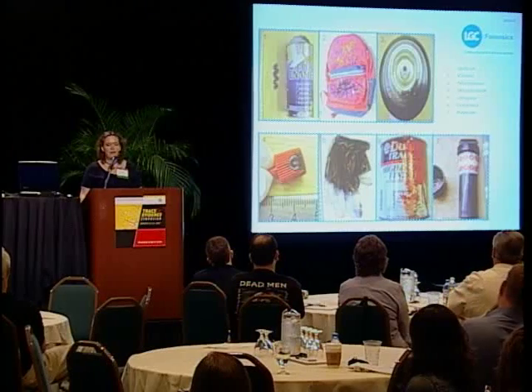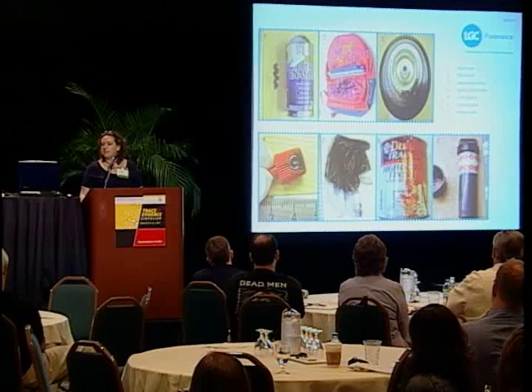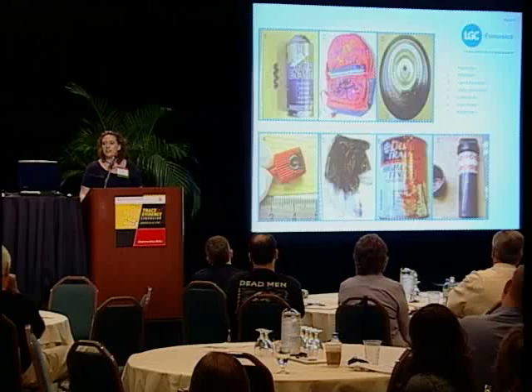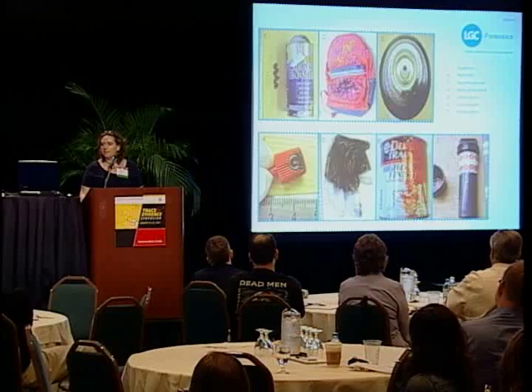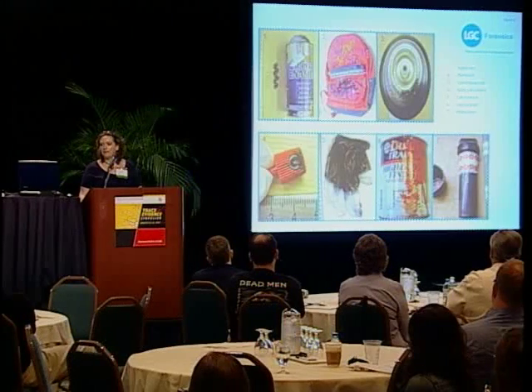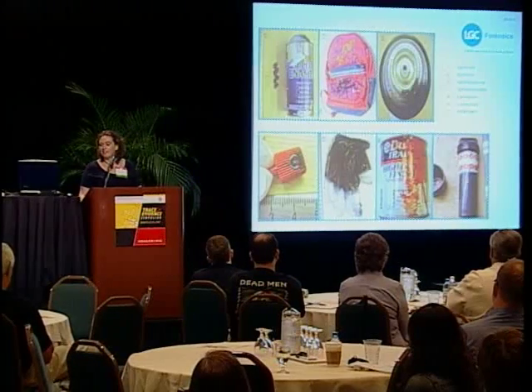A lot of the items that we received into the laboratory have been seized from suspects who've maybe been identified from the crime scene, either under CCTV, or who've actually been apprehended at the scene. And just because someone's at a scene, obviously things like train stations, it's not illegal to be there. So just finding them in the vicinity is not enough. And draw your attention to the rucksack. Your heart sinks on a Monday morning when you have one item submitted and you open the rucksack and it contains 25 different spray cans. So suddenly the week becomes a bit longer.